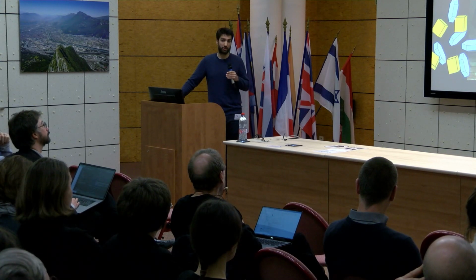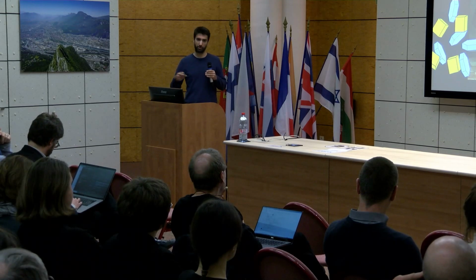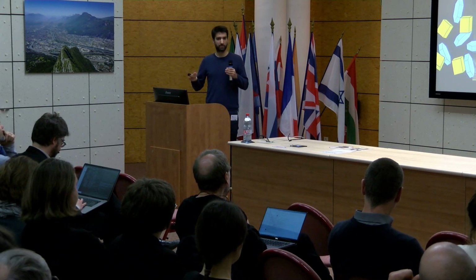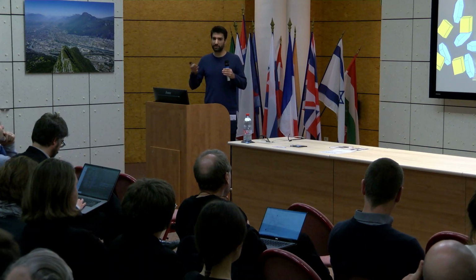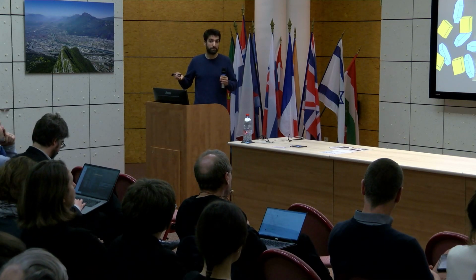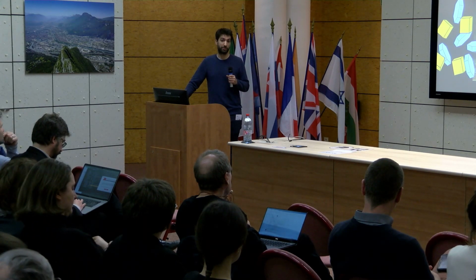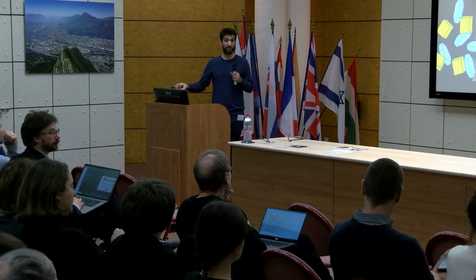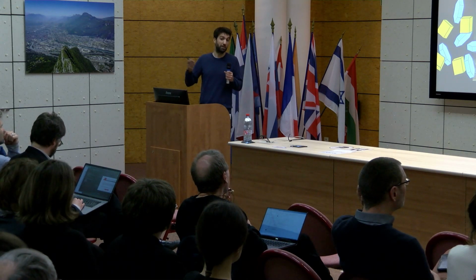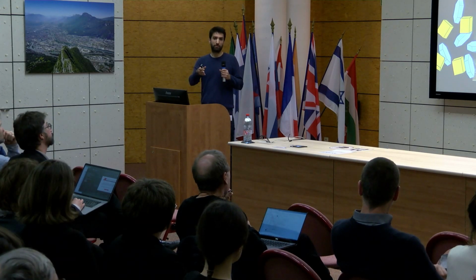This litharge-based oil, but I should say also that we have performed some other beam time, for example, at Diamond I-18, where we have worked on a lot of model samples where it seems to fit with plumbonacrite crystallizes when litharge is present. But then, of course, is it only something due to the oil? We still have a lot of work to do on this specific phase, and I know that your team detected plumbonacrite in obviously non-impasto layers because they are coming from other paintings, other painters. So this is perhaps not the only chemical pathway to plumbonacrite.